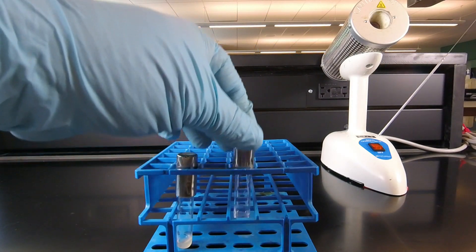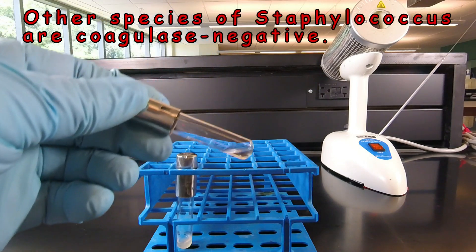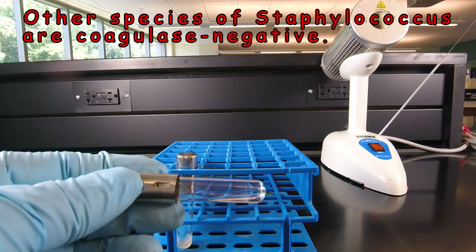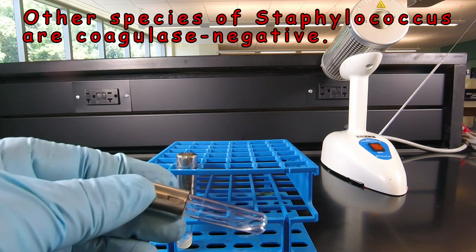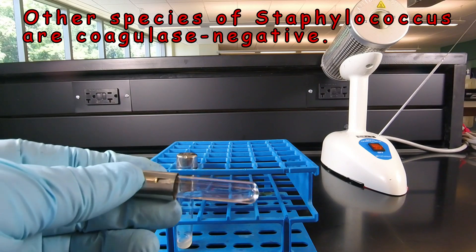This is a coagulase negative bacterium. We see that the rabbit plasma remains a liquid. It hasn't gelled.